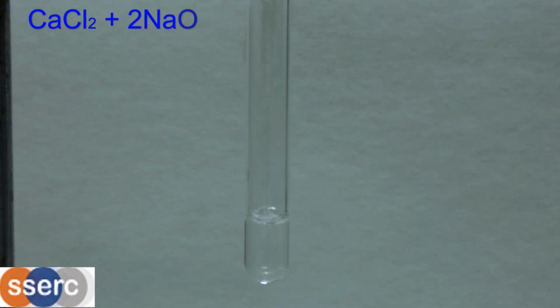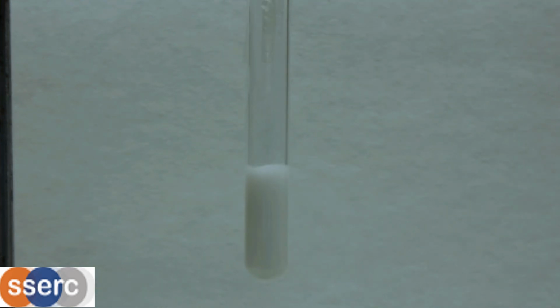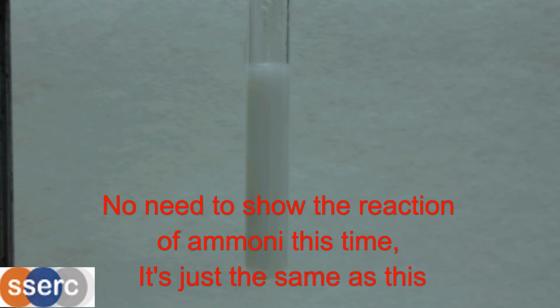Calcium compounds behave in exactly the same way as magnesium, as long as the concentration is fairly high, as calcium hydroxide does dissolve a little in water. In fact, it forms lime water. And like magnesium, it forms the same white precipitate in ammonia that does not dissolve in excess.